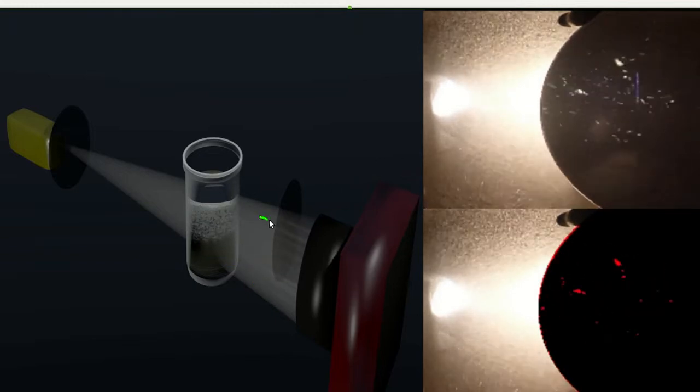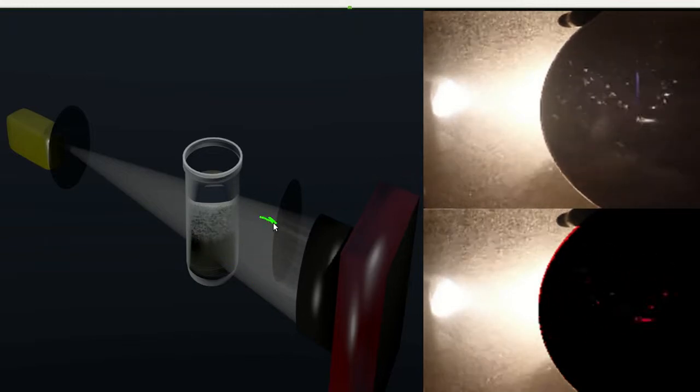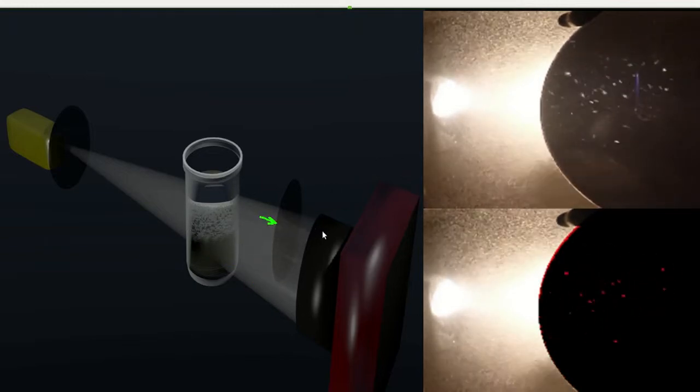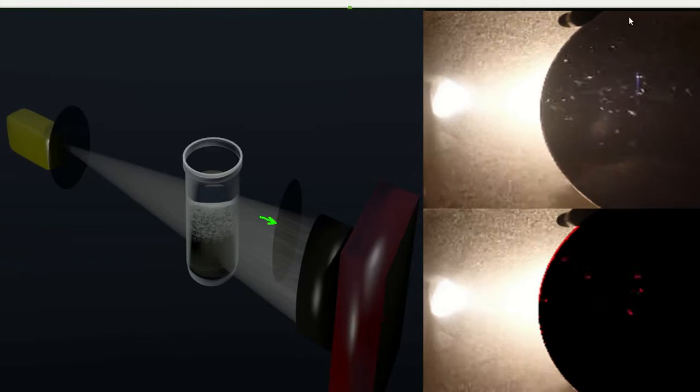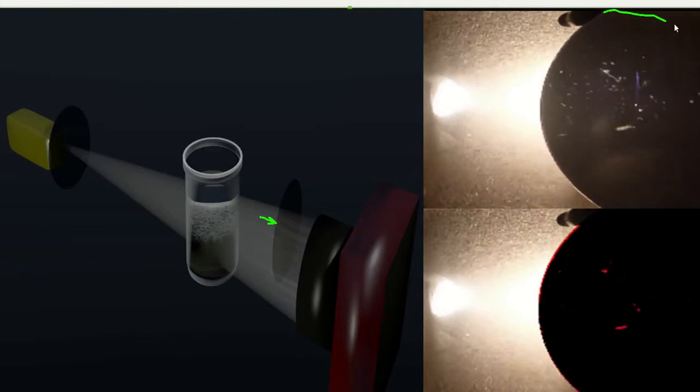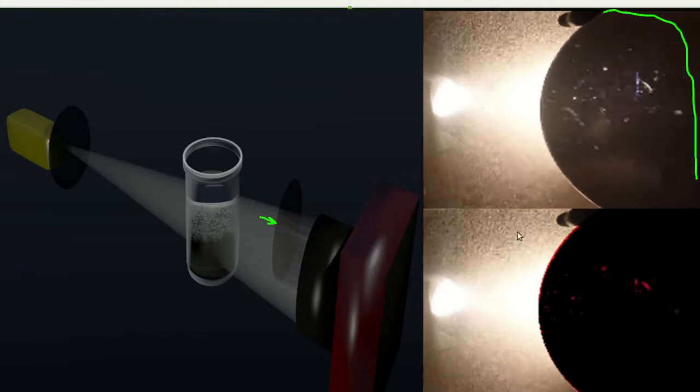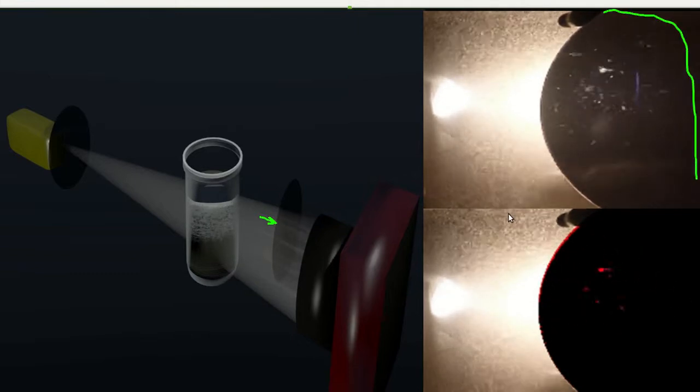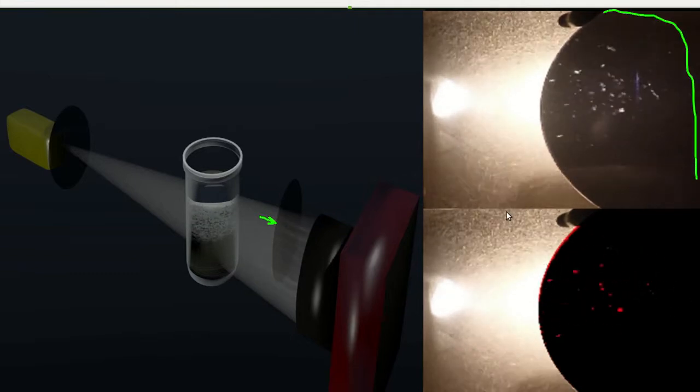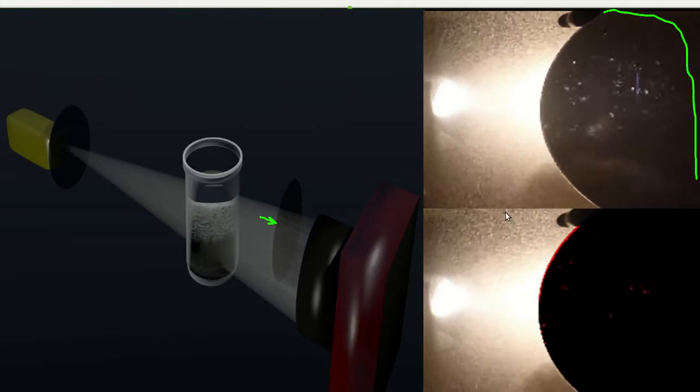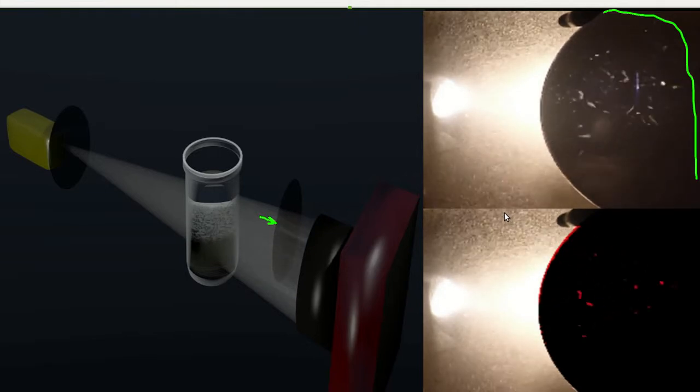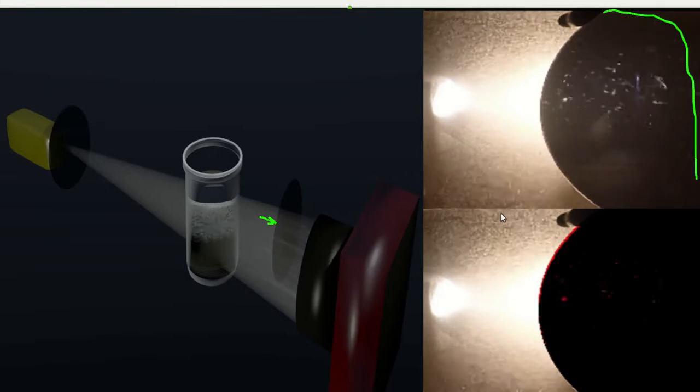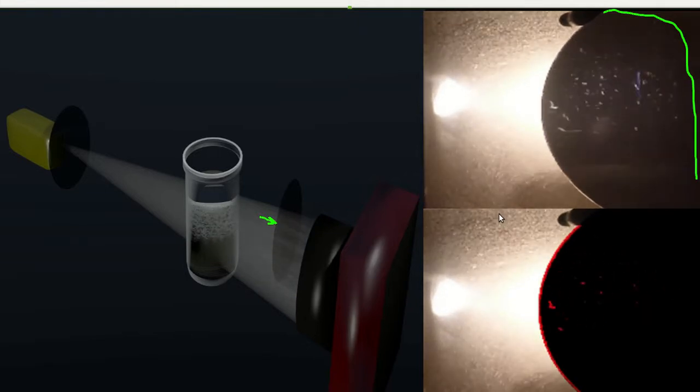Conversely, light that traverses through the sample and then through the analyzer screens out most of the air bubbles due to the lack of rotation of light, and therefore the API particles become much more visible.